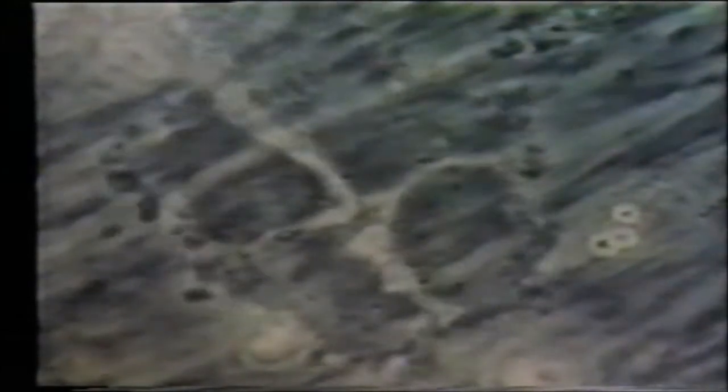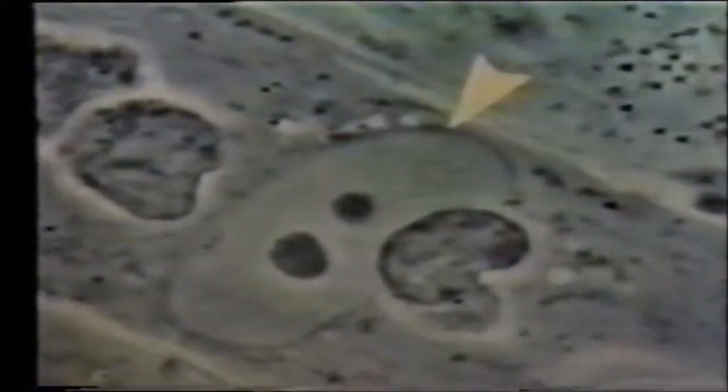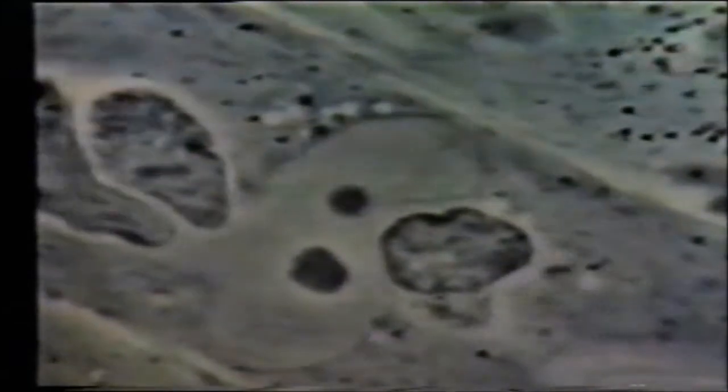And what you're seeing here on the screen is natural cell division, and instead of it dividing properly, you'll see at the middle of the screen, it stays conjoined, and it becomes what's called a binucleated cancer cell. Those two dark circles, those are the nuclei. The lymphocytes that are circled there, those are inside the cancer cell, and that arrow points to the cell membrane, and the lymphocyte on the outside is trying to get in.